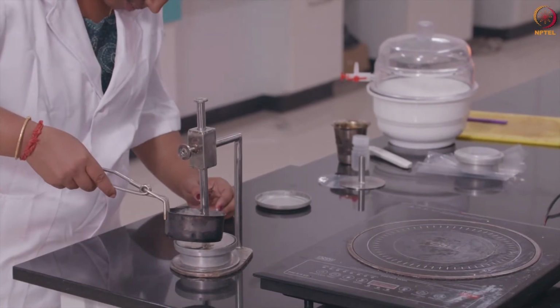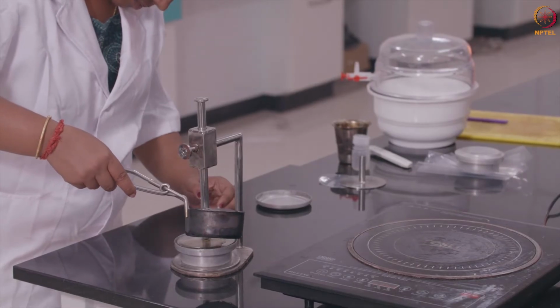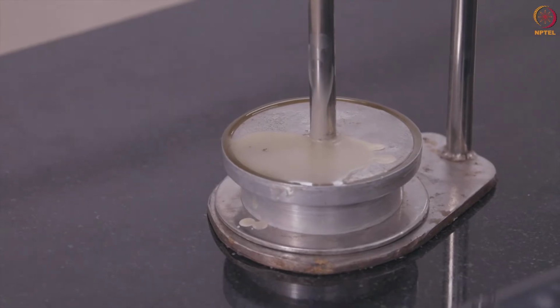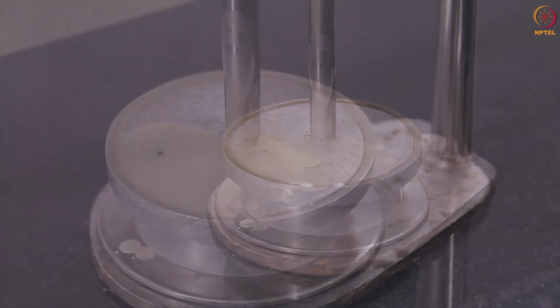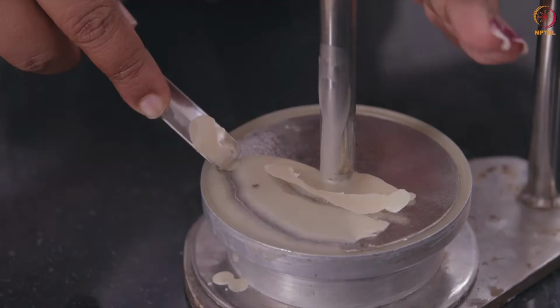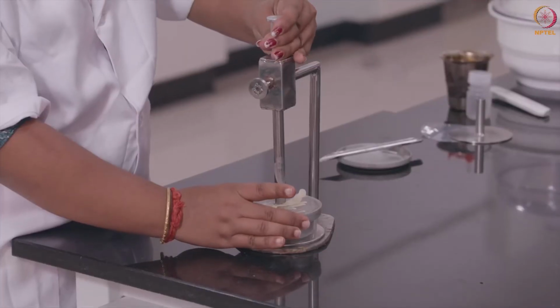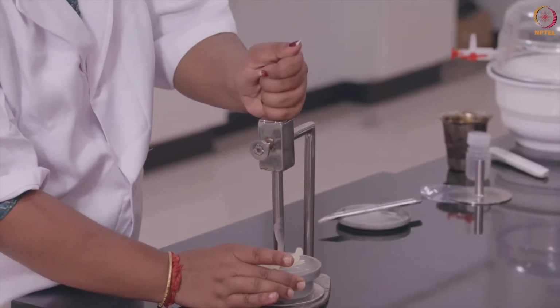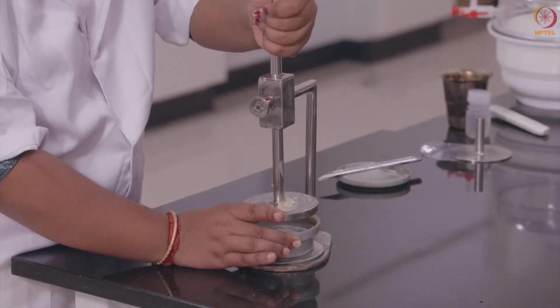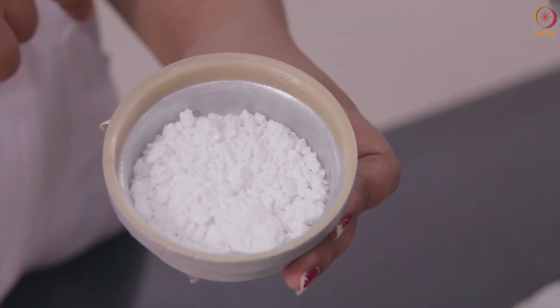This ensures that water vapor will not enter through the sides. Once it sets, lift the top plate. You can see the test film is now firmly fixed over the aluminum dish with the desiccant.